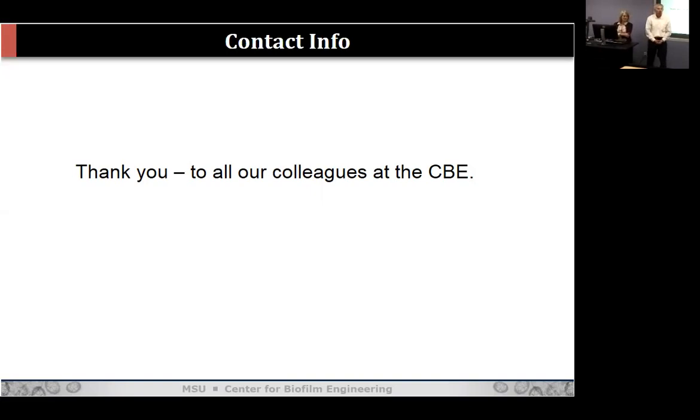So in addition to cell growth, can you also see nucleation growth of secondary minerals and begin to identify other solid phases that might be in your flow chambers? Yeah, so the reflection mode has allowed us to visualize some of these mineral crystals. I think you've also gotten fluorescence out of calcite. Is that right? Some of our graduate students and postdocs that I've worked with have done that. But yes, we have. It's a little tricky. Sometimes they're fluorescent. It depends on the mineral. Sometimes we can use that.